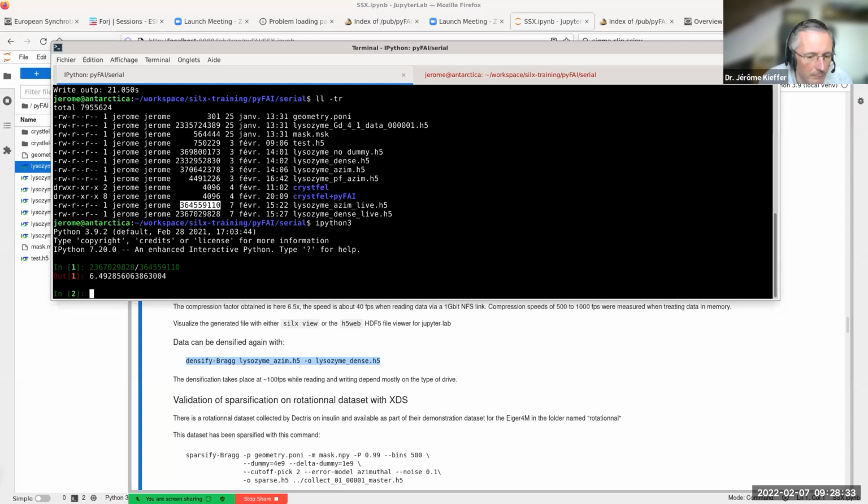Yes. Well, you have to consider that the data here are compressed with bit shuffle LZ4, and they contain mainly lots of zeros, which makes them easy to compress. The data which are stored inside are also compressed in bit shuffle LZ4, but because they contain mainly floating point values, they don't compress as well. So this reduces the compression rate that is visible as disk space.